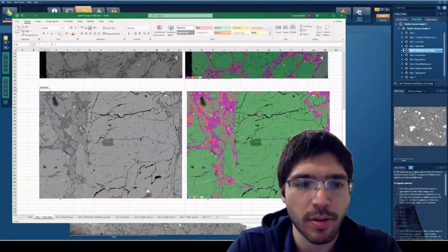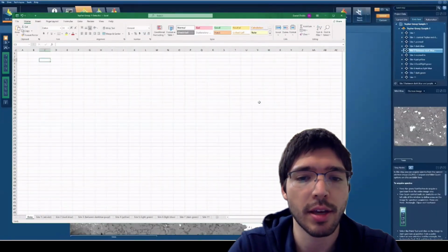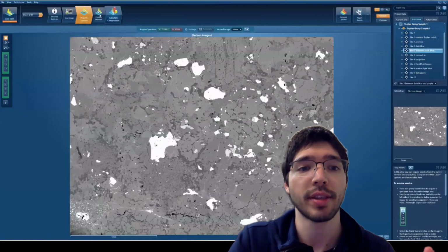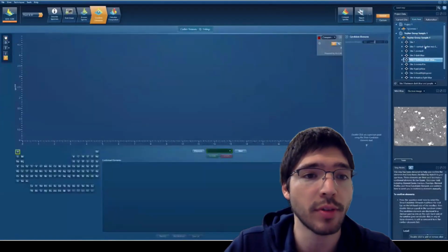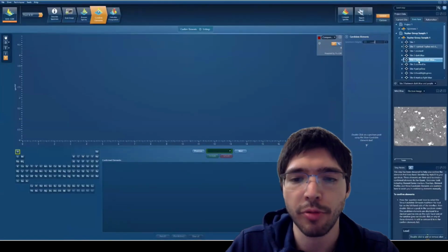Yeah, that's a great question. So this is run through Oxford Instruments. They essentially are the manufacturers behind a lot of the different detectors that we have. They manufactured the EDS detector that we have, and therefore they have this software tailored to whenever you're using that detector. They have several other processing softwares as well, depending on if you have different detectors for the scanning electron microscope. There, of course, are other tools you can use.